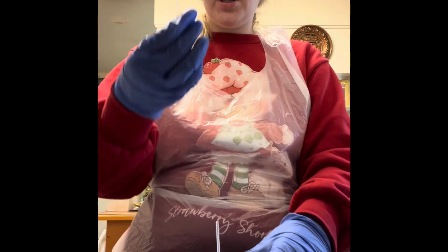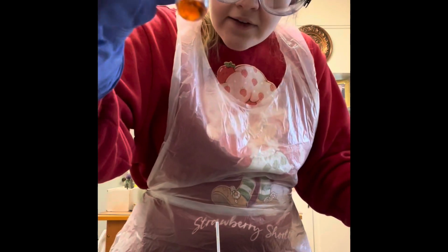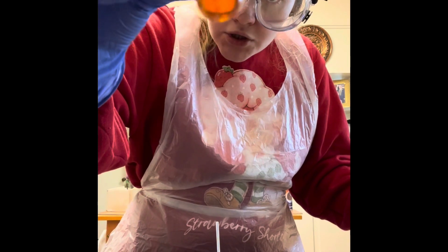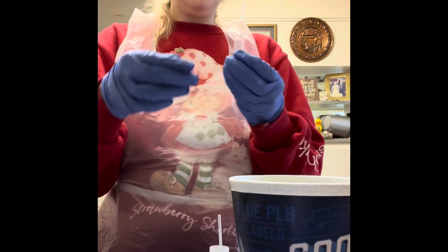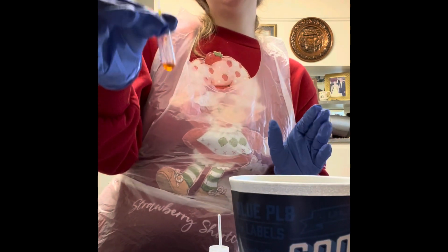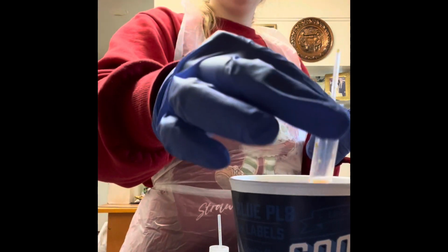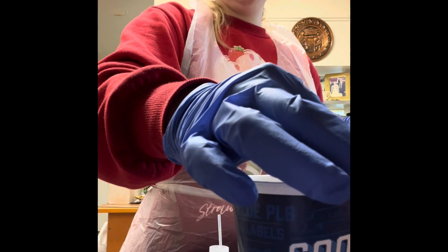And then I'm going to turn it upside down. Oh, it's kind of showing an orange. Okay. Let me record that in the data. So I've got my ice water right here, and it says that I'm going to submerge my mixture into the cold water for 2 to 3 minutes. So I'm going to do that all off camera.